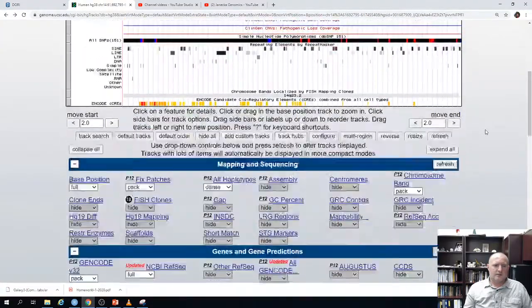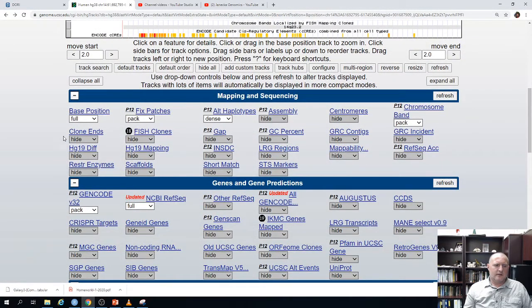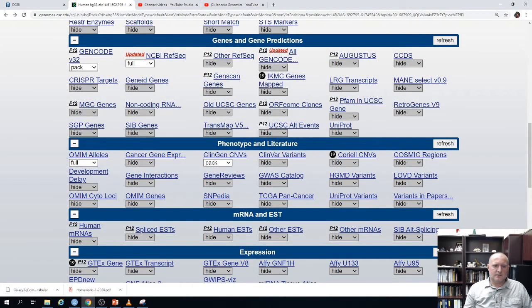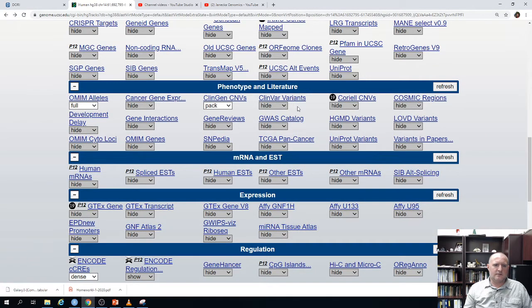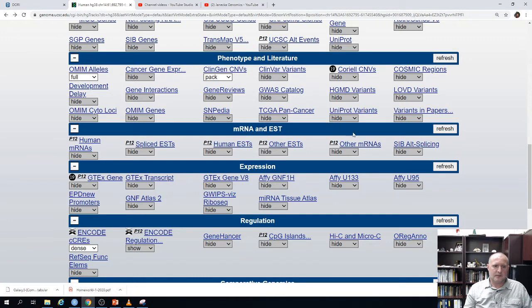If we scroll down, all the tracks we're looking at are organized by categories: mapping and sequencing tracks, genes and gene prediction tracks, phenotype and literature tracks. That last category has things like disease alleles and CNVs associated with diseases. A lot of these alleles and CNVs don't have a direct causal relationship — they could just be associated with a phenotype from a study, and the specific role they play is not necessarily known.